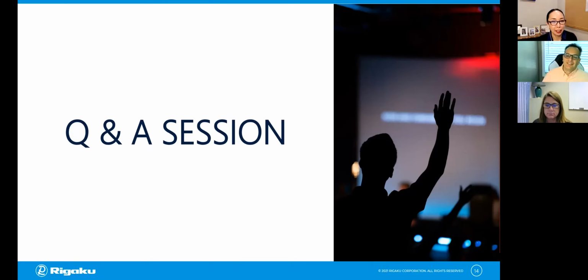So I guess the answer is yes, but I haven't tried it yet. Maybe Angela and I will explore it and do another workshop on it. I put a link to the quick reference, and I also put the DeepImageJ link, which I had to dig out myself when the message came in. Those are in the chat if anybody wants to dig into it themselves.